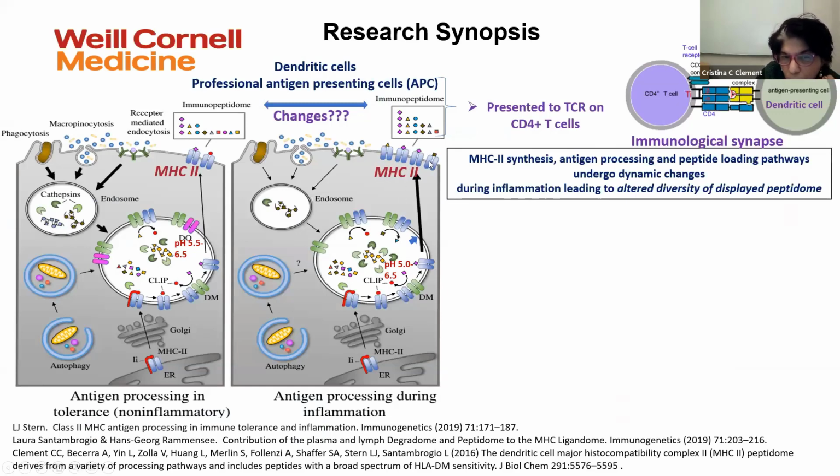The way we do the immunopeptidome is that we quantify via ELISA to start with the same amount of MHC class 2 for the elution. So in some cases, if I go back in time and discuss with the lab of Dr. Stern who did the elution, yes, I think there were some preps in which MHC class 2 was in lower amount than in the control. But I have to review those data with them. Thank you.